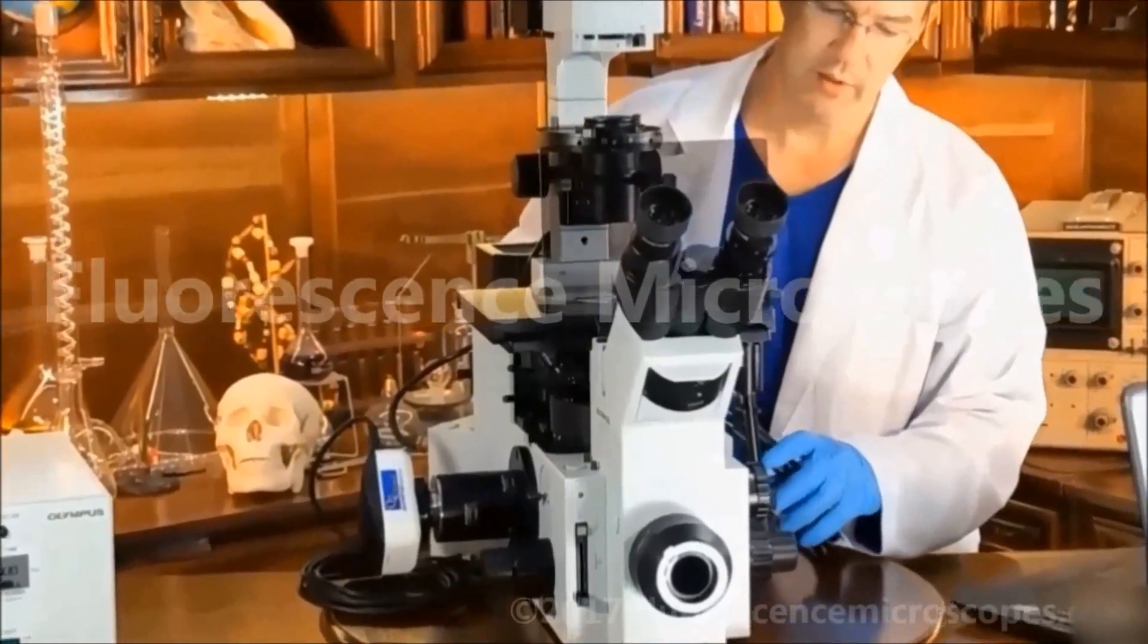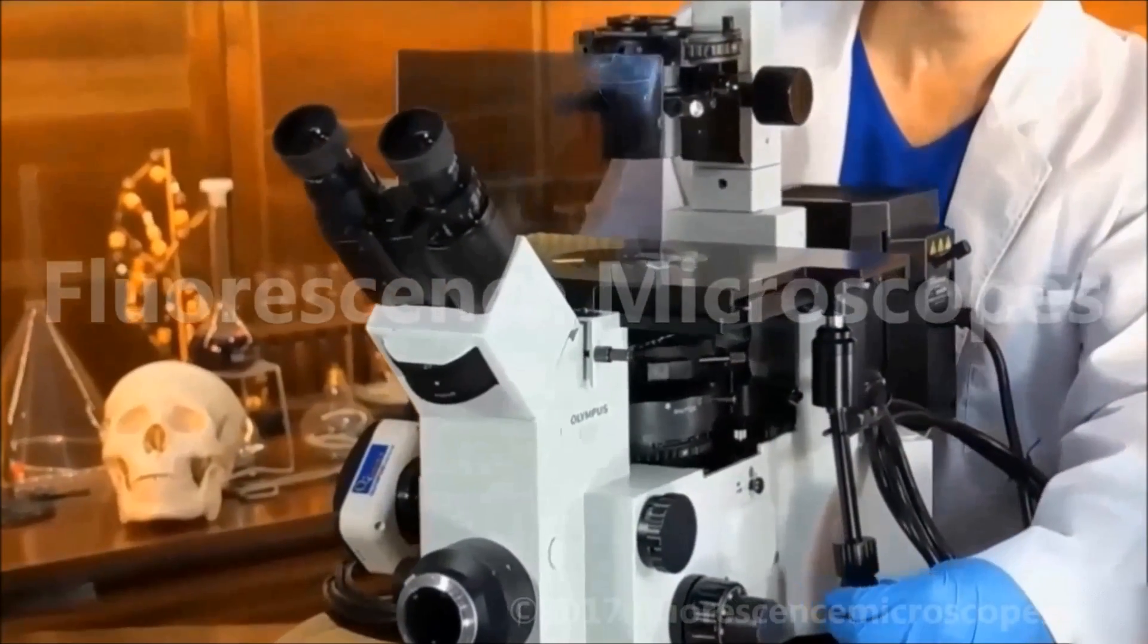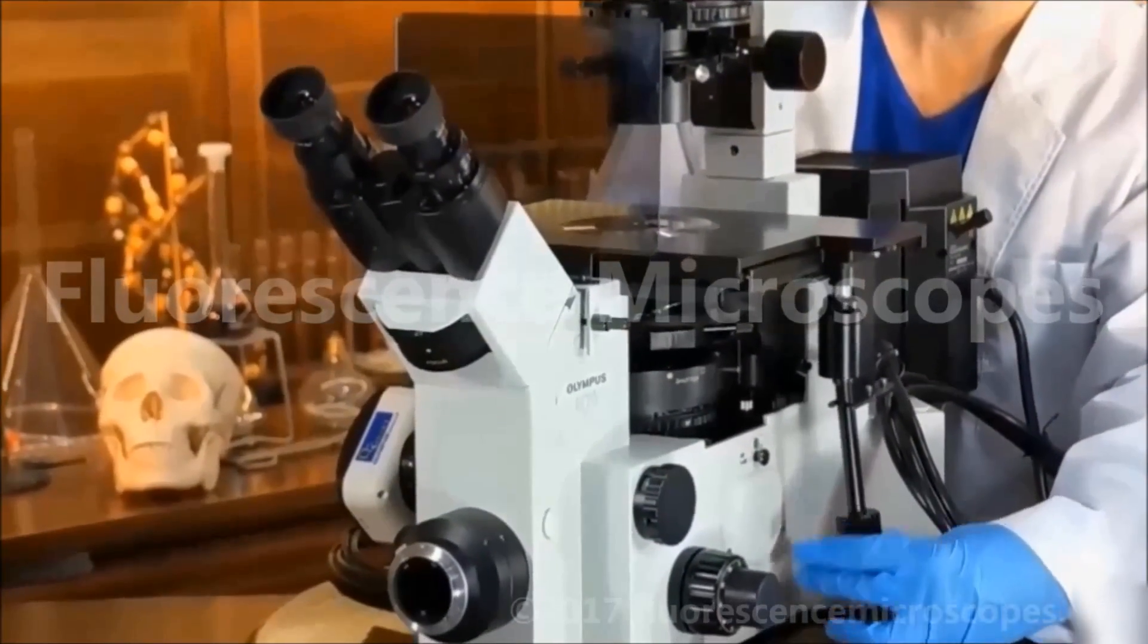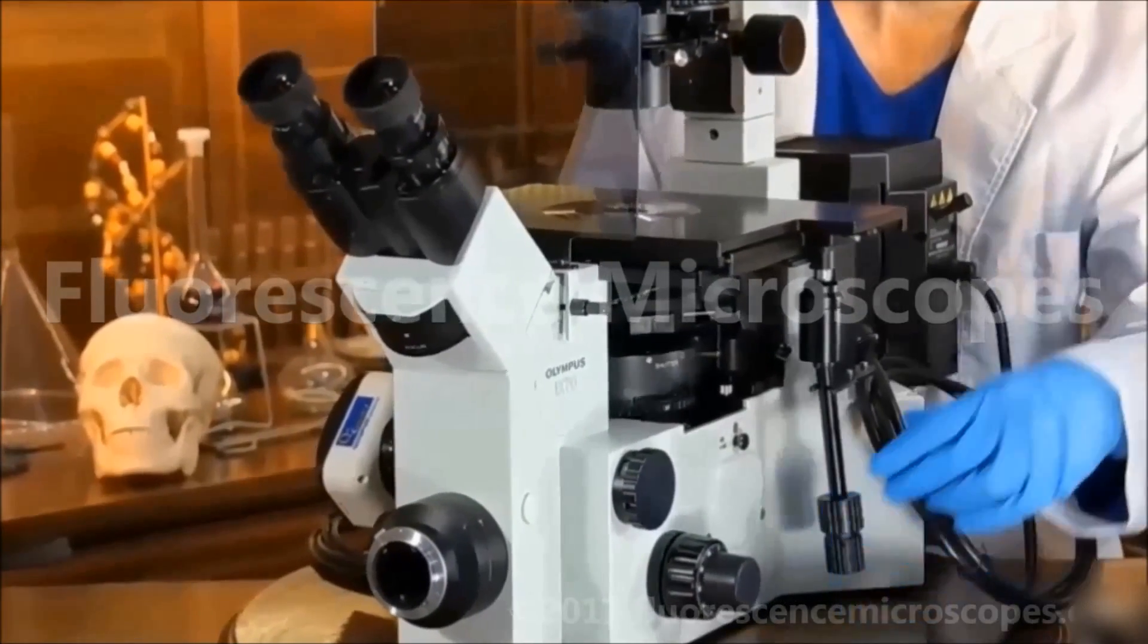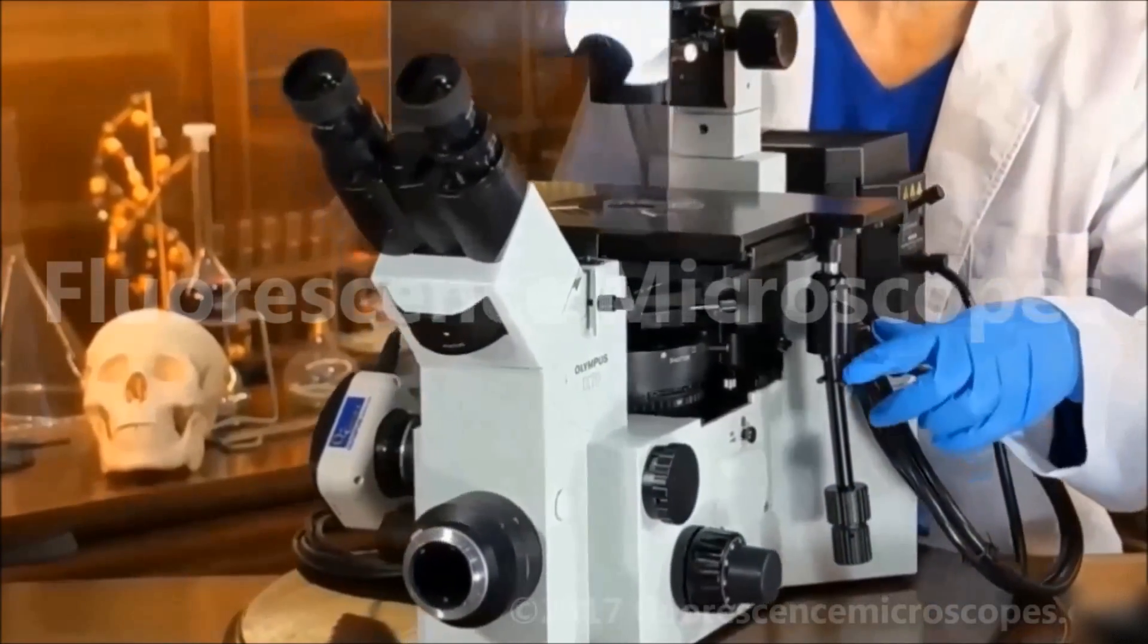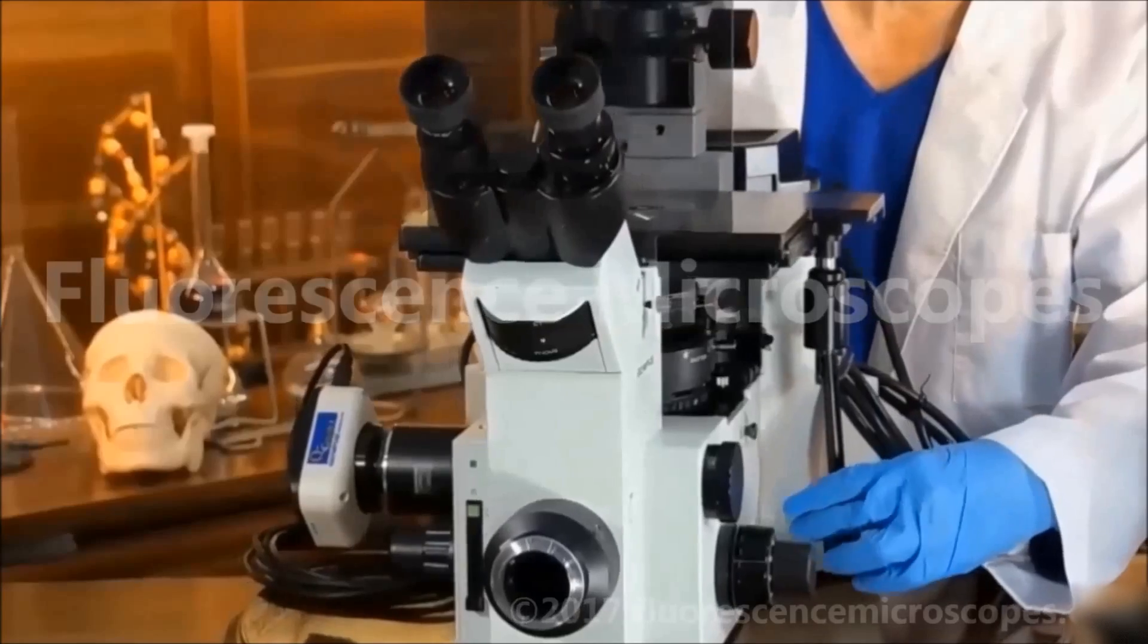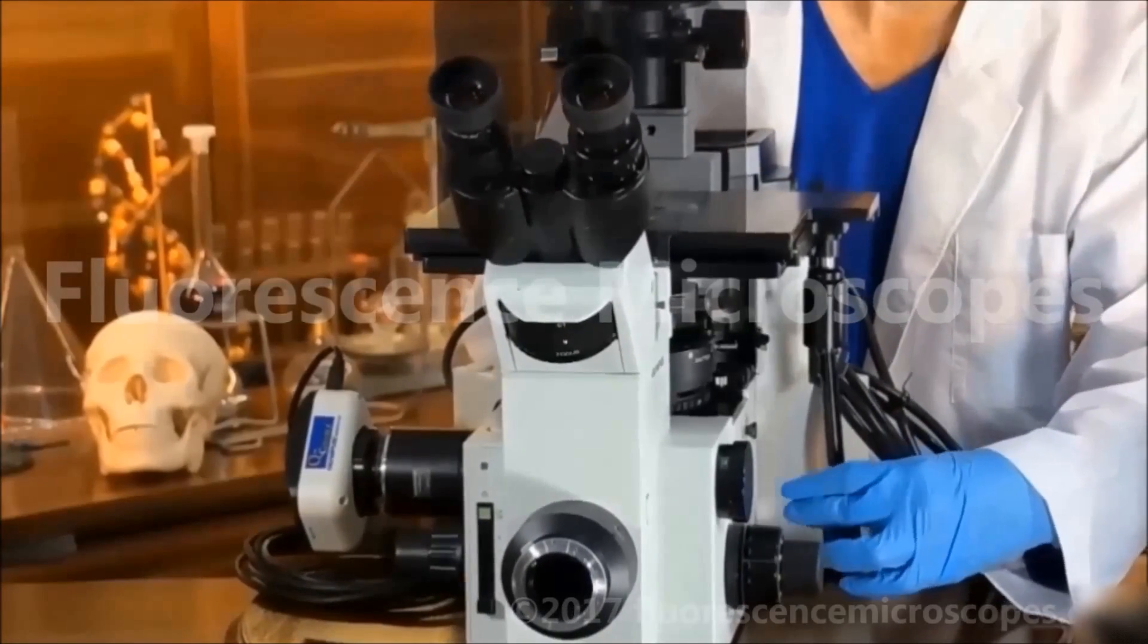This has a XY mechanical stage. We also have a zero drift included. Those are nice to keep them from drifting in one direction.